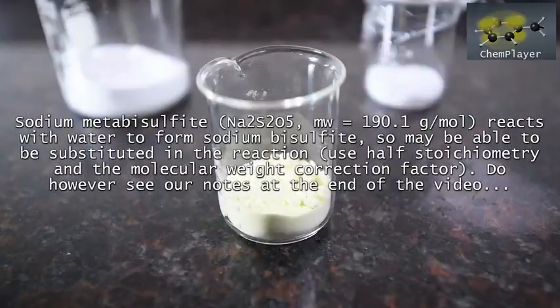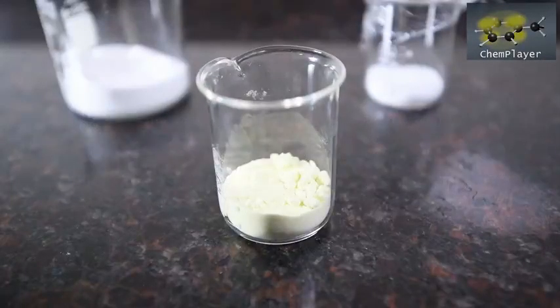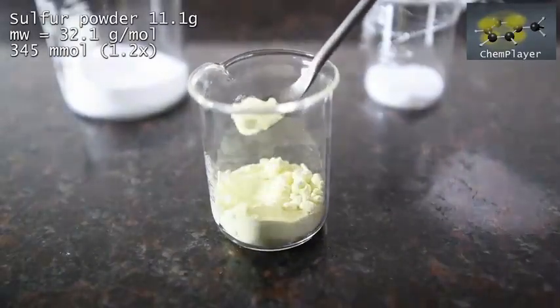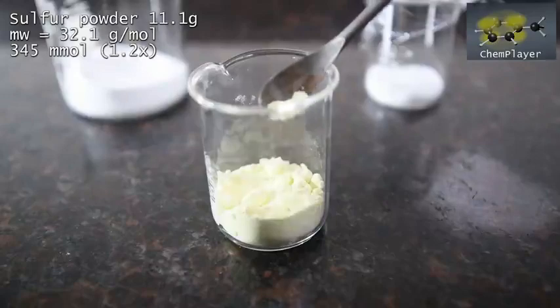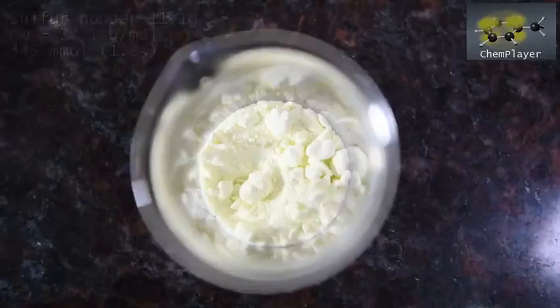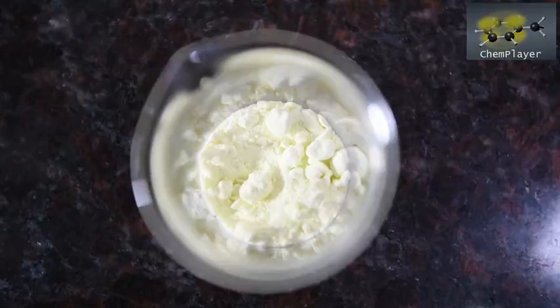Next up is our source of additional sulfur: we've got 11.1 grams of elemental sulfur here, and this is going to be a 20% molar excess in order to ensure the reaction is complete. It's less common than the metabisulfite, but still available if you look carefully.